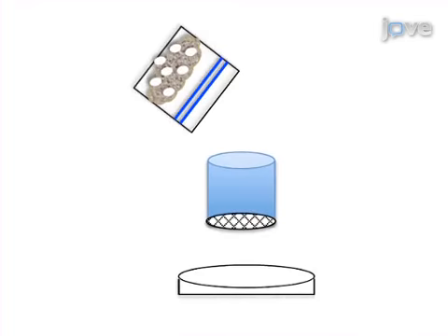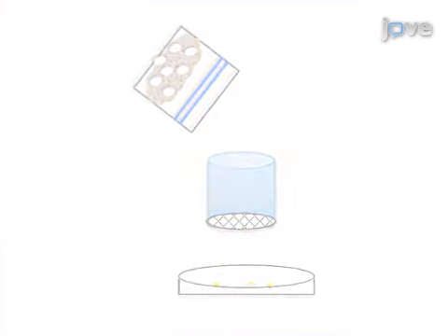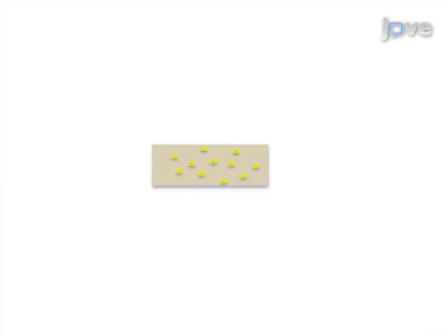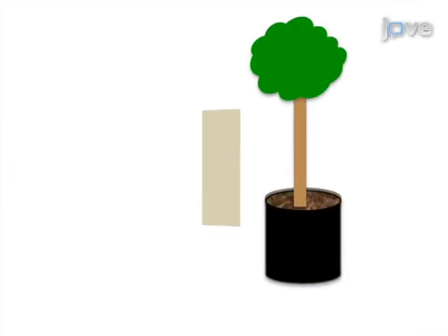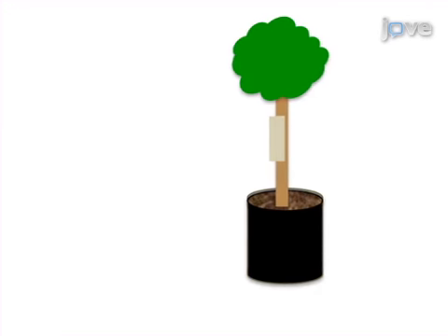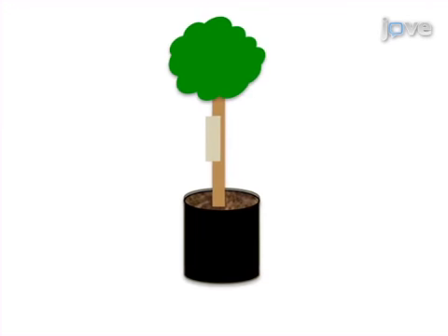The second step is to obtain a homogenous batch of eggs by sieving them away from the adults and other debris. Next, the eggs are counted out, placed on foam pads, and affixed to the bark of the test trees. At the same time, tests to confirm the viability of the eggs are set up.